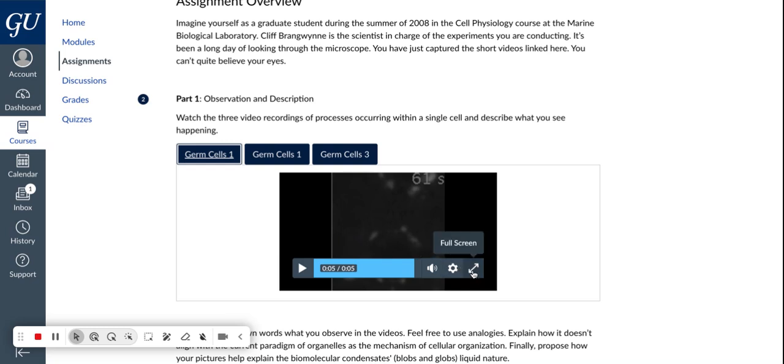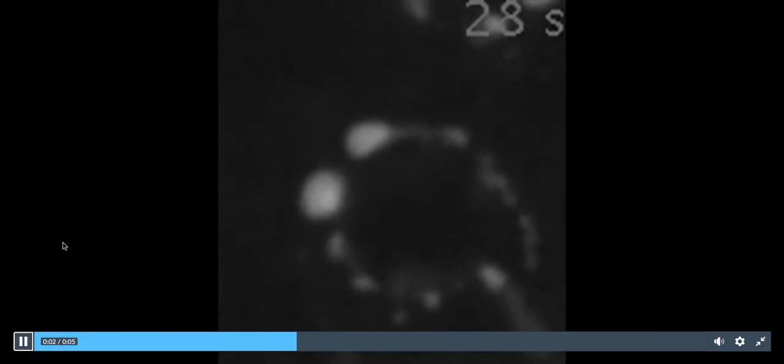All right, so let's take a look at what's happening here in this video. First and foremost, what it looks like is happening is we see this relatively homogeneous mixture of cellular substance, likely a combination of proteins and nucleic acids.